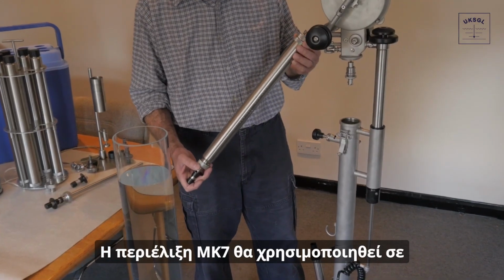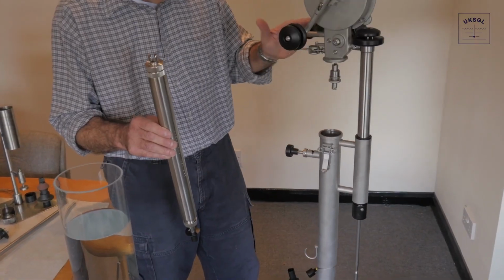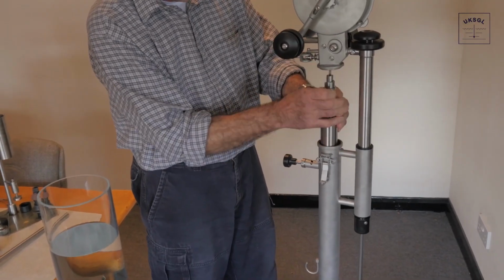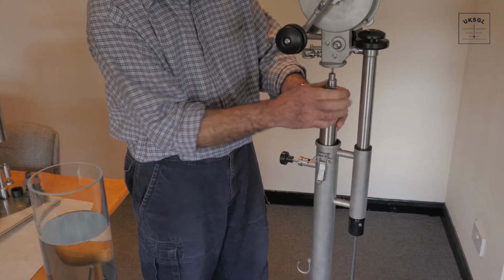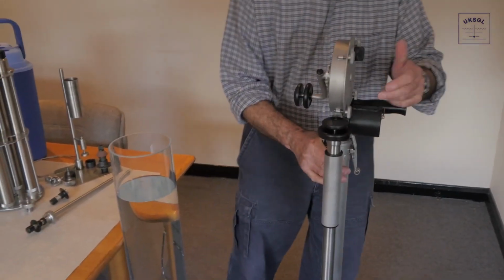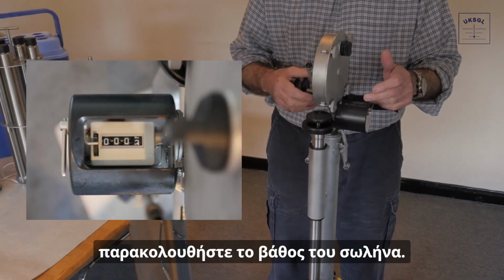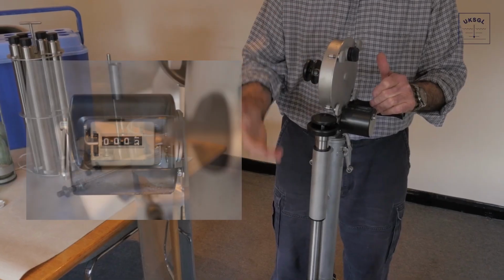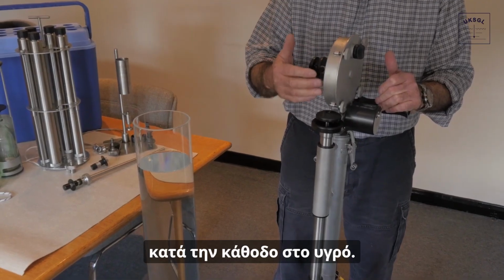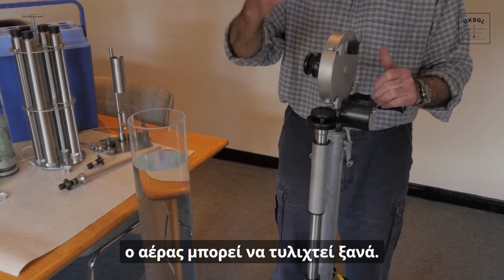The MK7 winder will be used to demonstrate how an RVP sample is taken in practice. The tube is attached to the winder via the key. The tube is then lowered at a steady rate whilst using the counter to monitor the depth of the tube. Owing to the design of the all-level probe, the tube only fills during descent into the liquid. To bring the tube back up, there is no restriction on how quickly it can be wound back in.